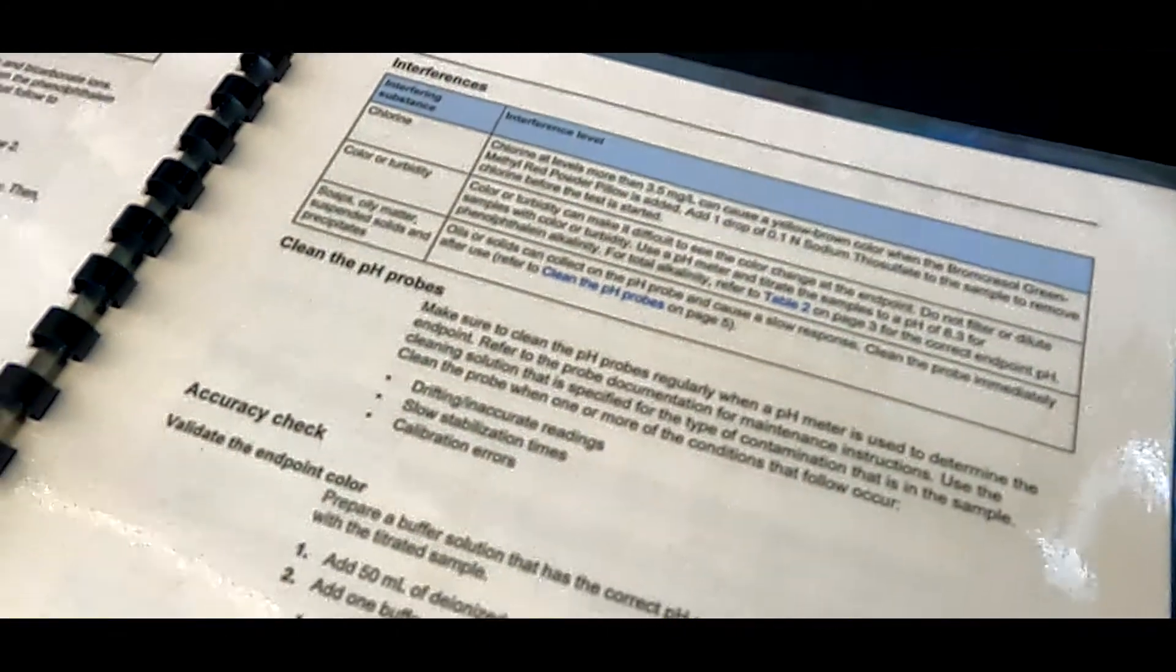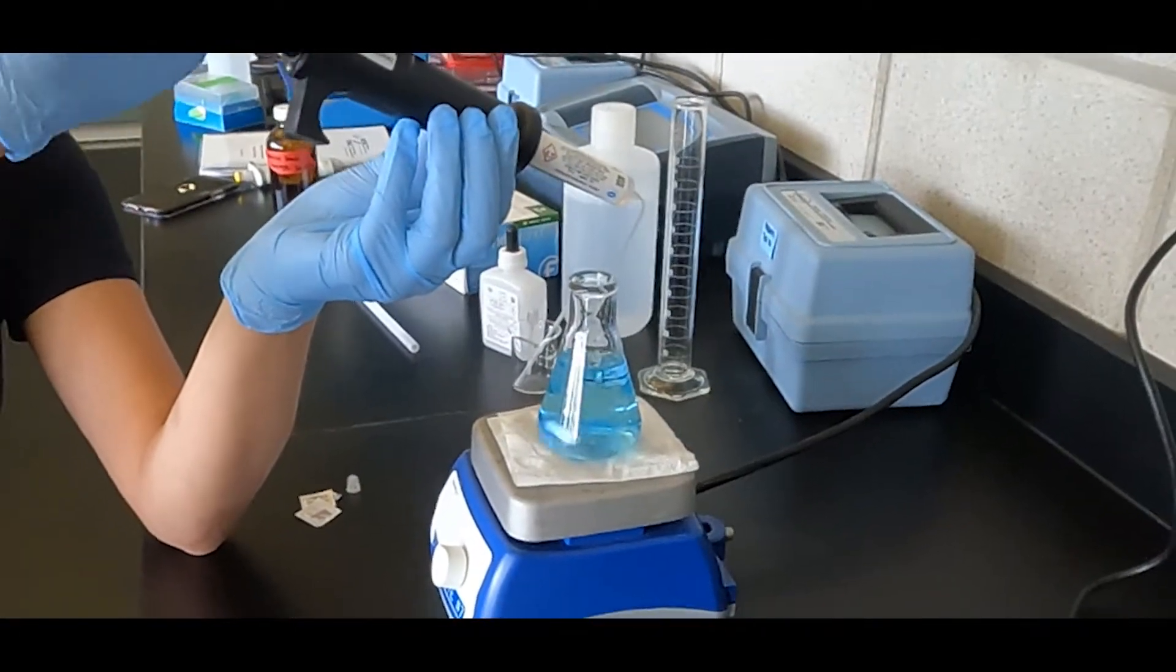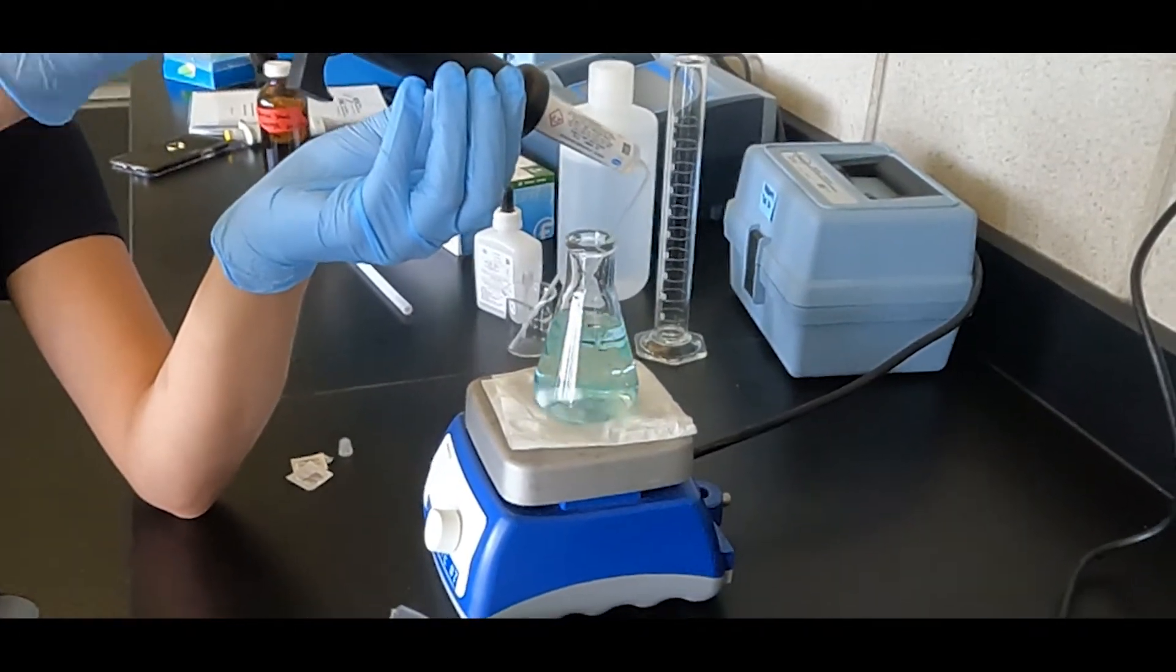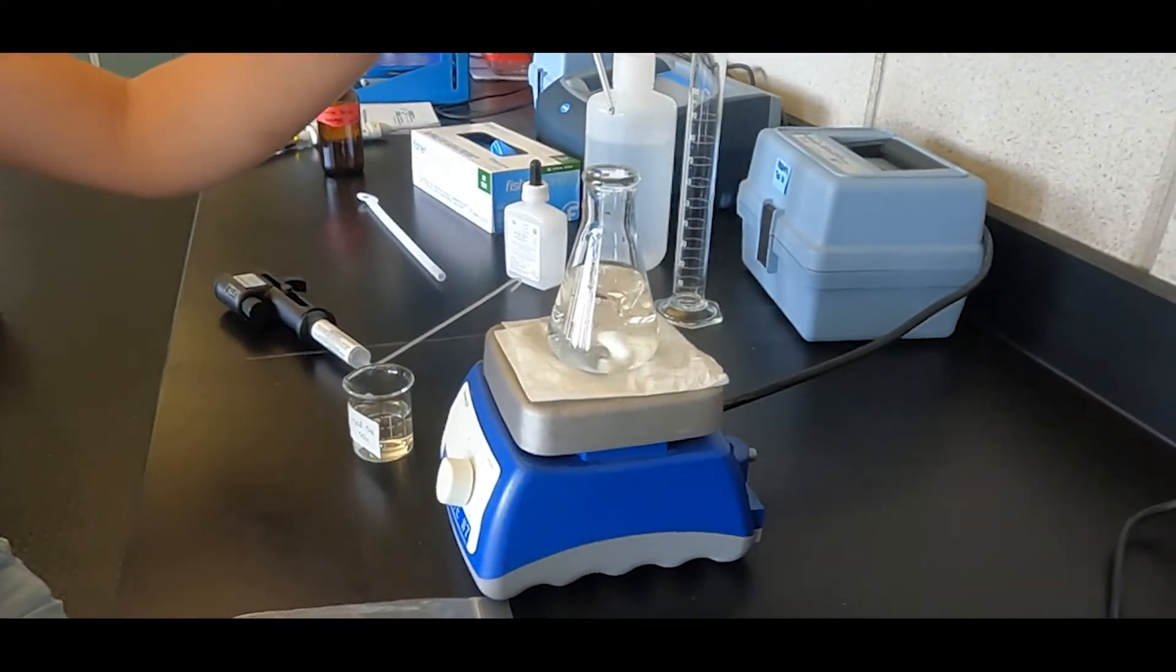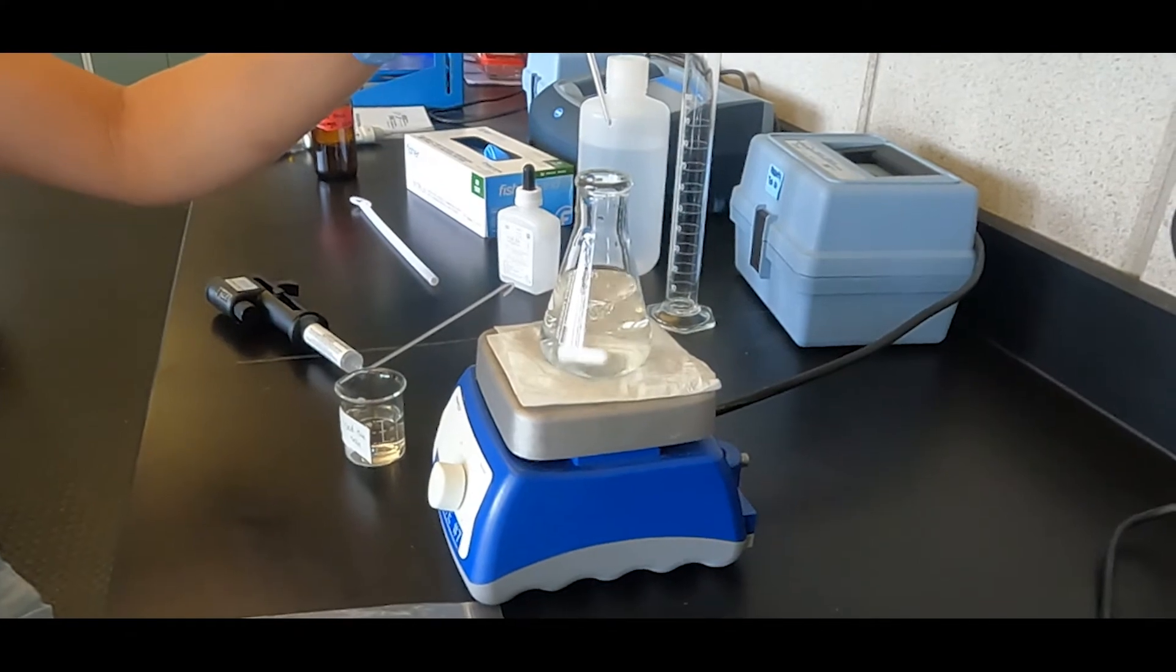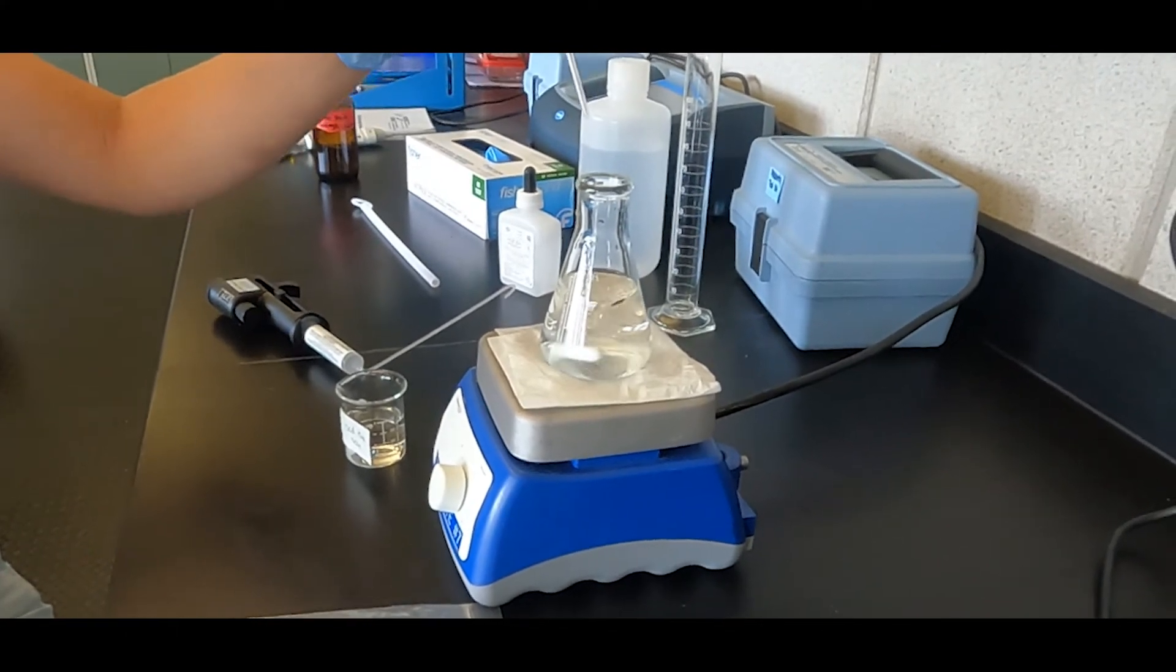It is important to note that if chlorine is present in a sample, it can cause a yellow-brown endpoint during the bromcresol green methyl red titration. To avoid this interference, add a drop of sodium thiosulfate solution to quench the chlorine before you start the test.